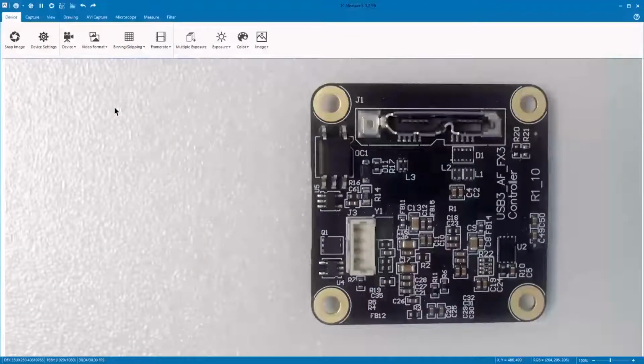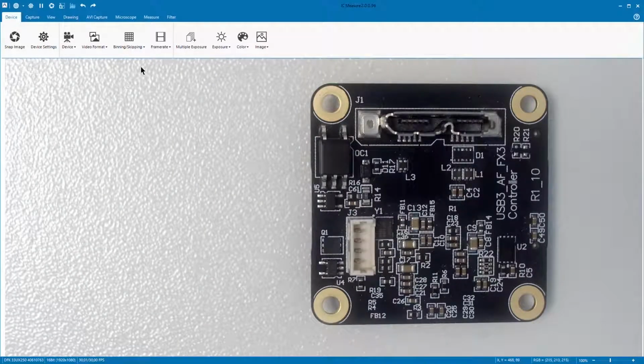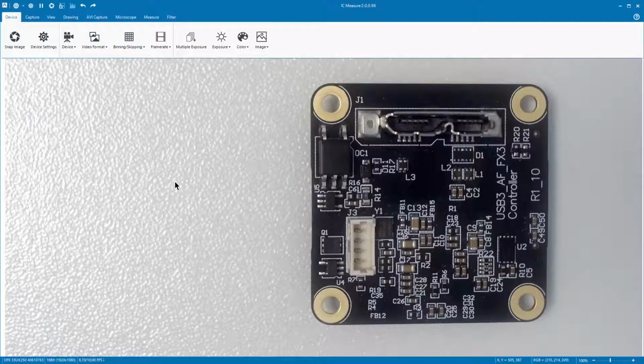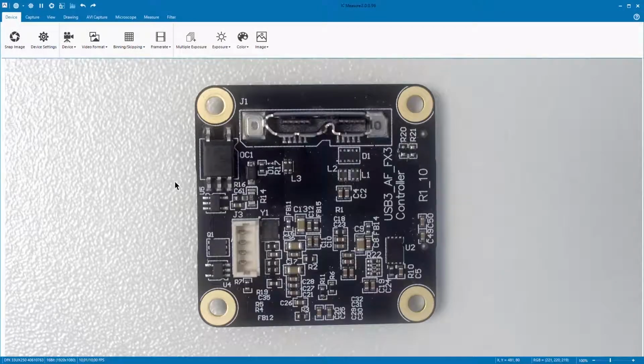The number of frames per second sent out by the capture device can also be specified via the frame rate drop-down menu. This is helpful when defining the bandwidth used by an image stream generated by a capture device. Camera settings can be adjusted for specific requirements. For easy access, the most important settings are also available via the Tool menu.